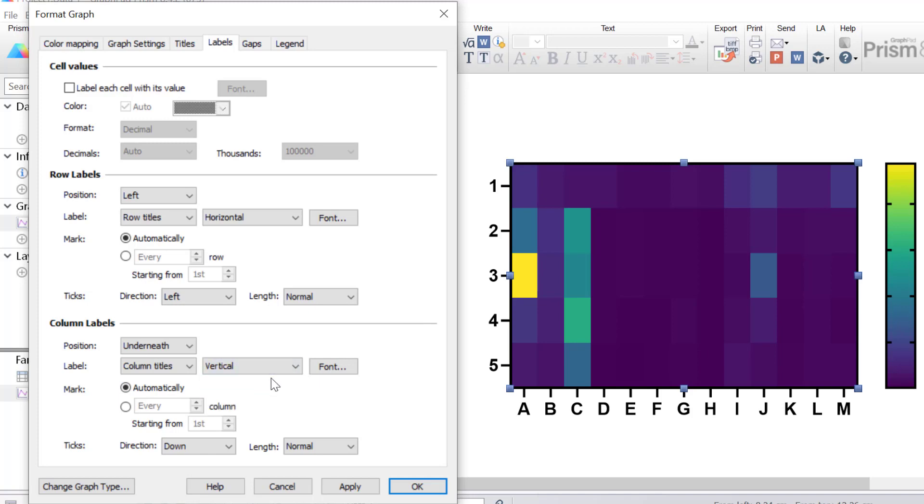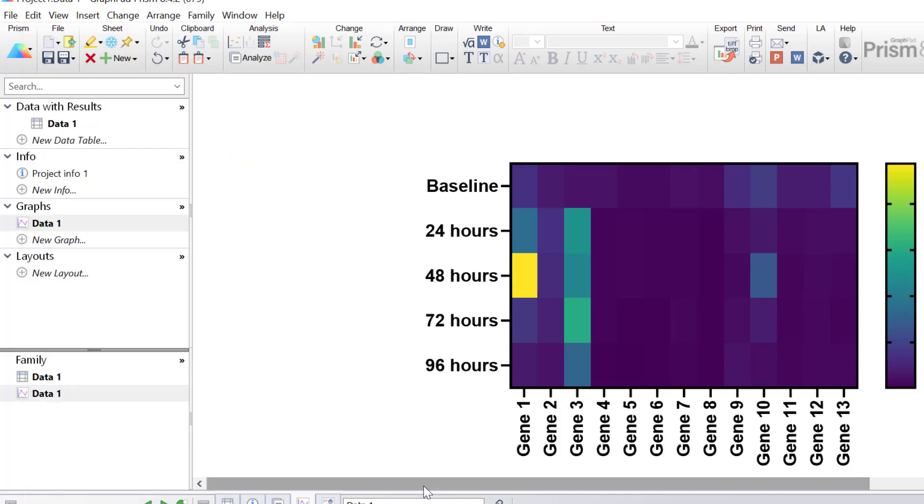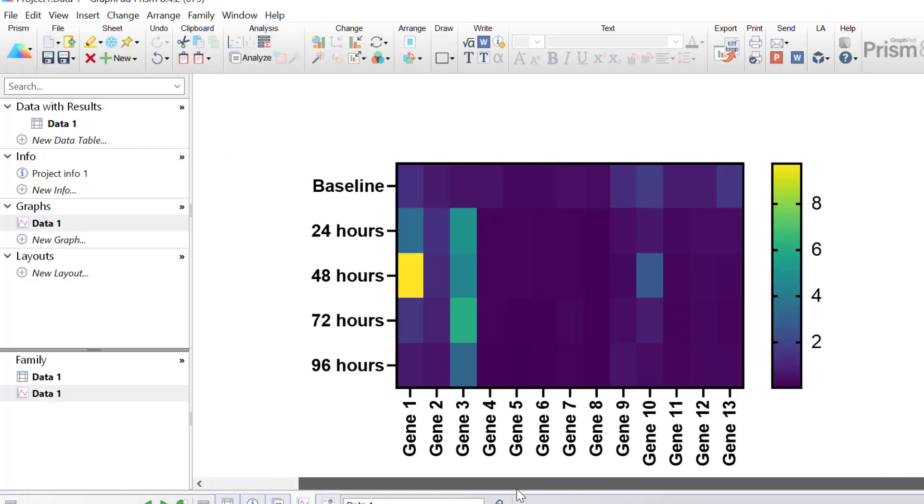And I'm also going to change the orientation of these to be vertical. Just because there are quite a lot of columns here, if I don't present this as vertical, some of the labels will actually not be presented. Then I'll click the OK button to return back to the heat map.